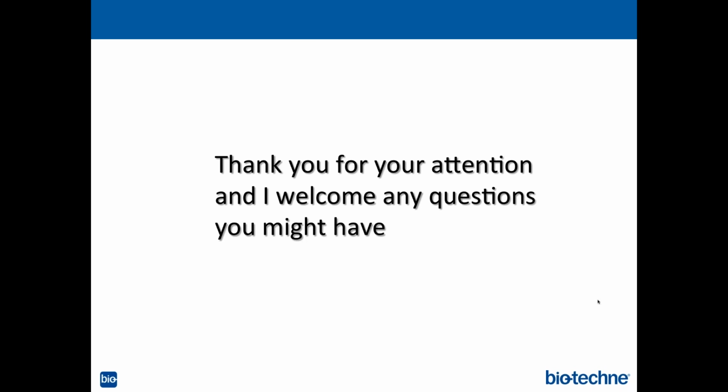Yes, you're absolutely correct. You can do that. I haven't shown data for that. That is something we have tried in-house. Yes, you can mimic a polyclonal. The only question is how many clones would you feel comfortable with mixing reproducibly? But absolutely you can do that, and that's something we're going to investigate more going forward, most likely. You can do the same with mouse monoclonals, obviously. You can make an artificial polyclonal. You're correct.